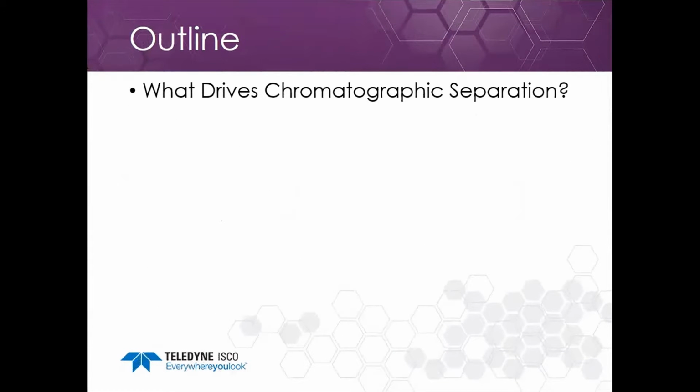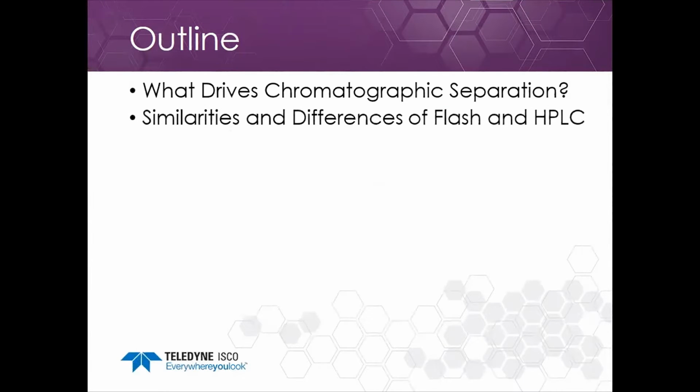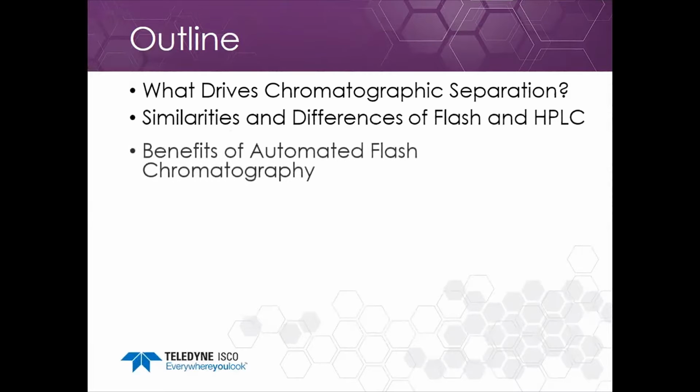So today we're going to discuss what drives chromatographic separation, and the similarities and differences between Flash and HPLC.